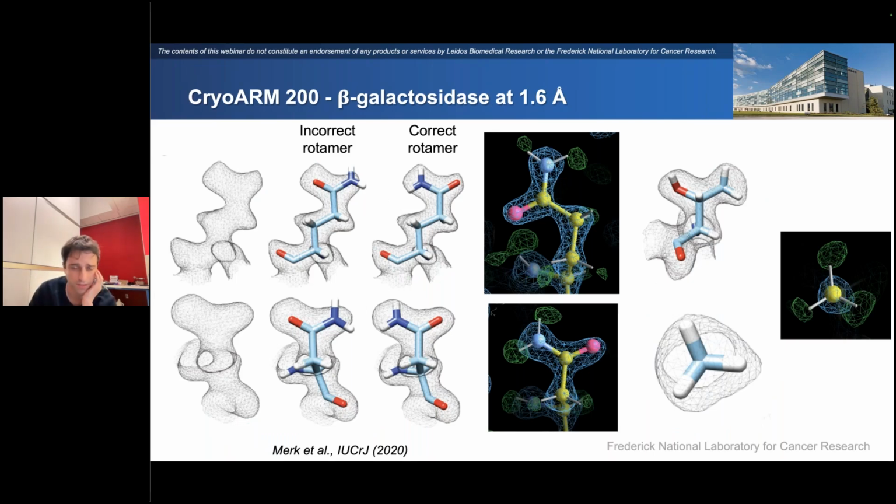Again, going back to the fitting of the amides, obviously with the lower resolution beta-gal map and without the difference maps, we can see this bulk density for the hydrogens, and we use that for the fitting. But now with the difference maps, what was a bulk density is now two punctate densities for the hydrogens. We see that both for the glutamines and the asparagines, and similarly for the methyls, we can start to see punctate densities for the individual hydrogen atoms, and the fitting just becomes easier.